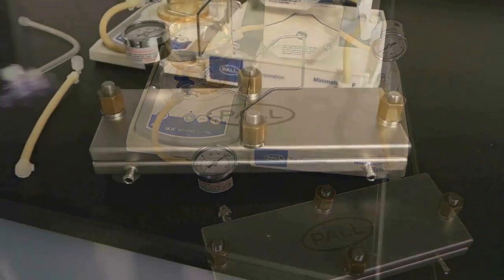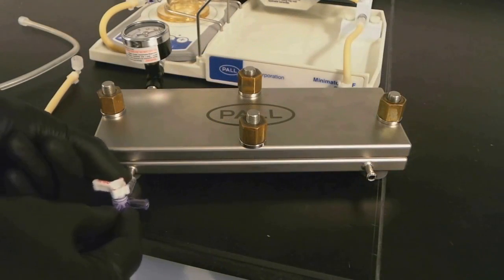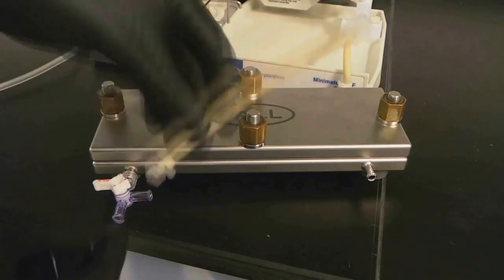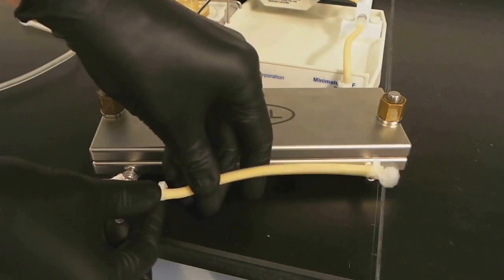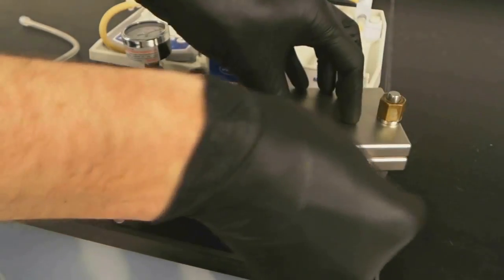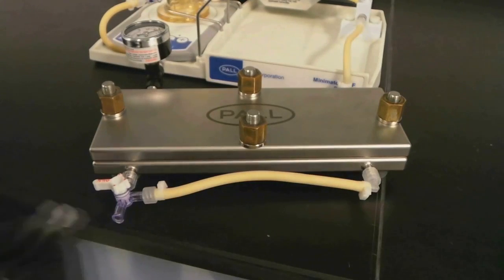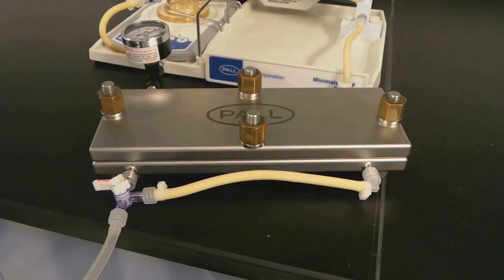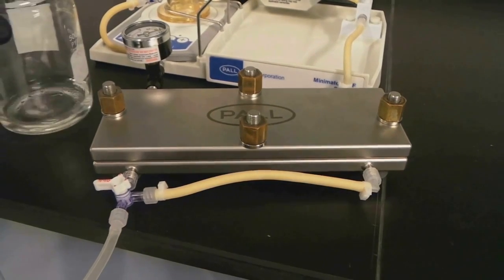On the opposite side of the holder, attach a three-way valve to the filtrate outlet, then connect another piece of tubing from the T to the opposite port on the same side. Finally, connect another piece of tubing from the valve and place the tubing into a waste container.